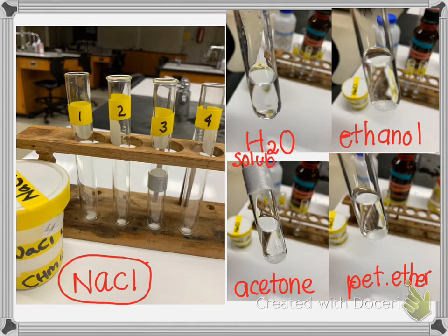On your own. So NaCl, if you look in here on picture 1, this is test tube 1, there's no salt left. Now this is ethanol, and if you look closely right here, there's still salt. What I did was I added 3 milliliters to each one of them, and I let them sit for about a minute or so. Then I took a stirring rod and really tried to stir it to see if I could get it dissolved. This one did not dissolve, and so in ethanol it's insoluble.